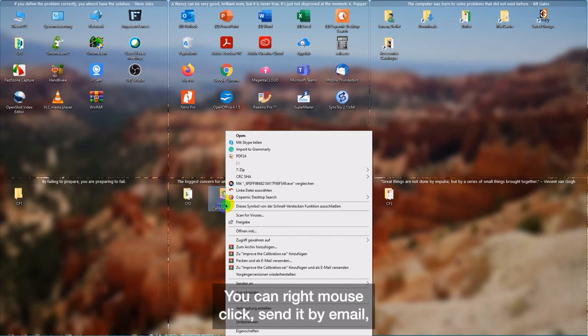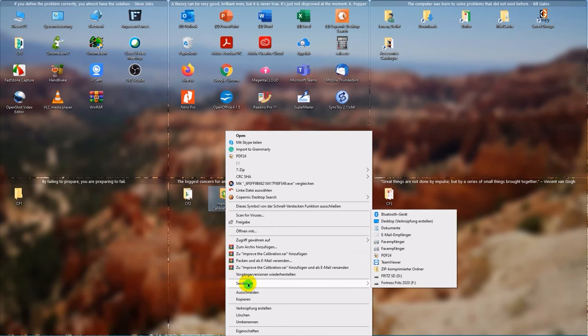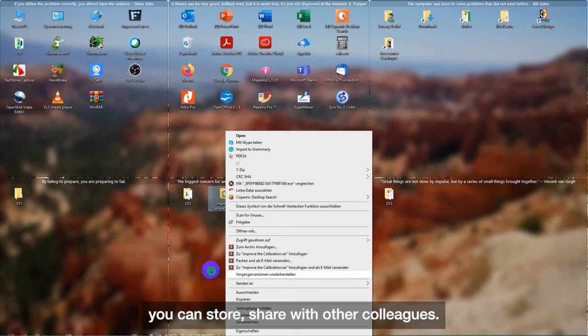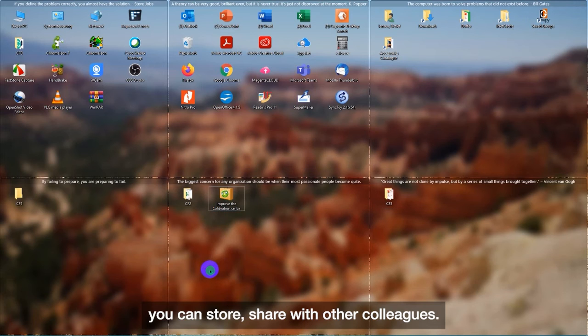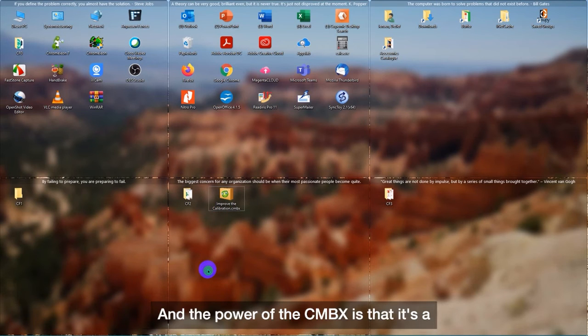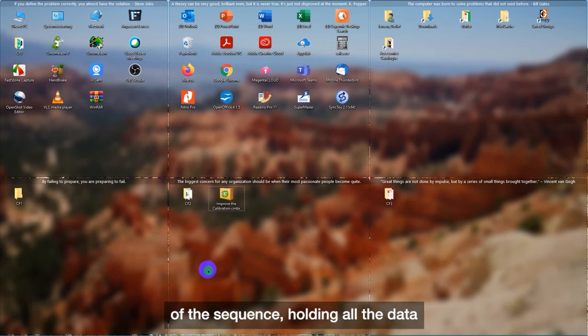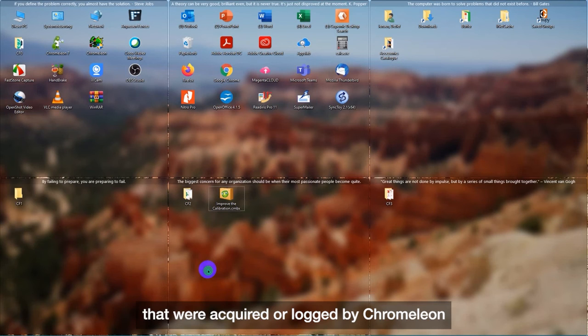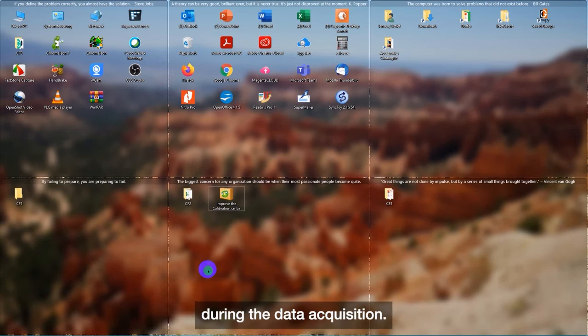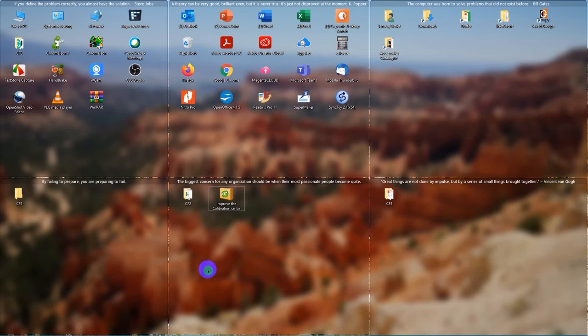And now you can do what you want with the CMBX file. You can right-mouse click, send it by email. You can store, share with other colleagues. And the power of the CMBX is that it's a condensed version of the sequence holding all the data that were acquired or logged by Chromeleon during the data acquisition.